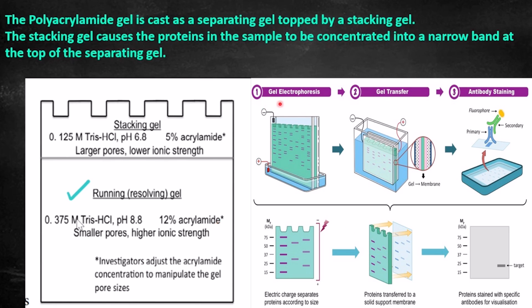So the first step, as we have already discussed, is loading. Here loading will be done. Proteins are negatively charged, always remember. They will move from the negative cathode to the positive anode.